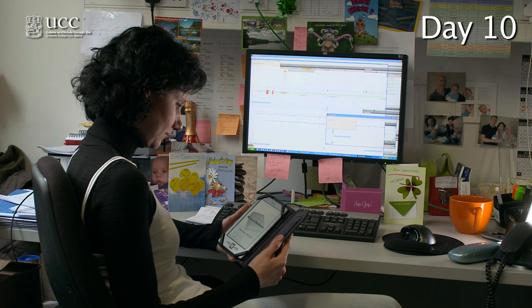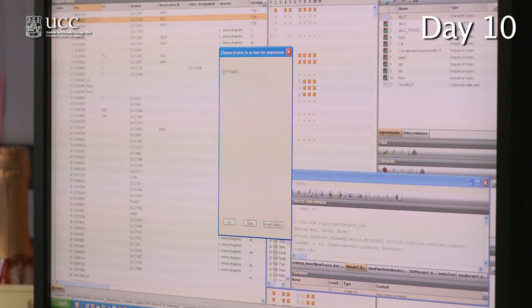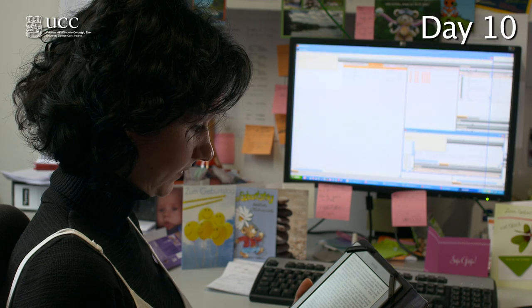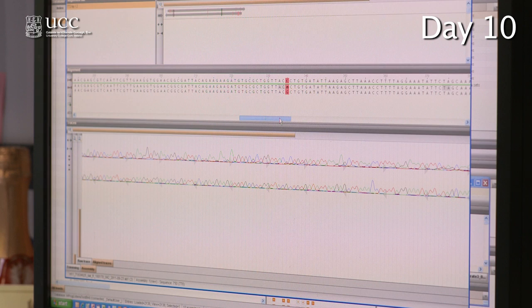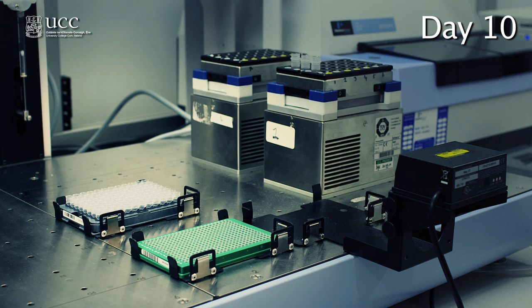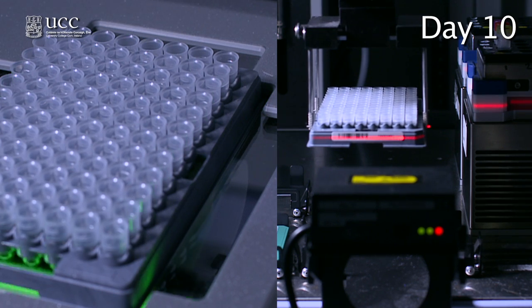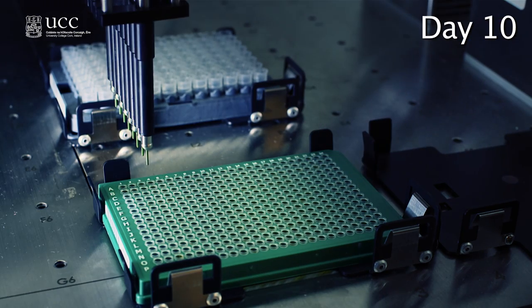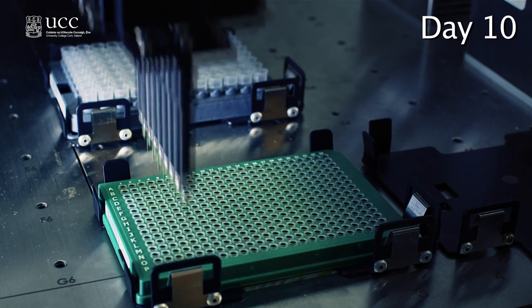Three days later, DNA sequence data are downloaded and automatically checked with specially designed software. Here, input from the scientist is minimal. Sometimes DNA sequences fail and need to be repeated. Traditionally, this is a complicated and time-consuming task, but scientists here at ERI have completely automated this cherry-picking using a robotic process they have developed.